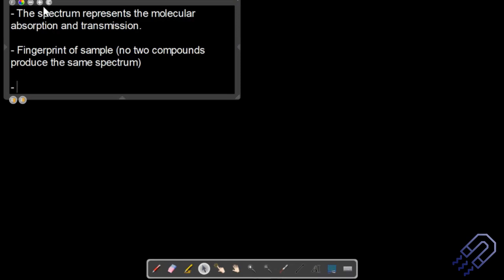Let's say, for example, you take a UV visible spectrum. Two different elements might have a similar band gap, and the chances are they might have a similar peak position. So UV visible spectra cannot really tell you what kind of element we have. But FTIR spectra definitely give you more information about the property of that material, and can also help determine the exact material. So FTIR provides the following.